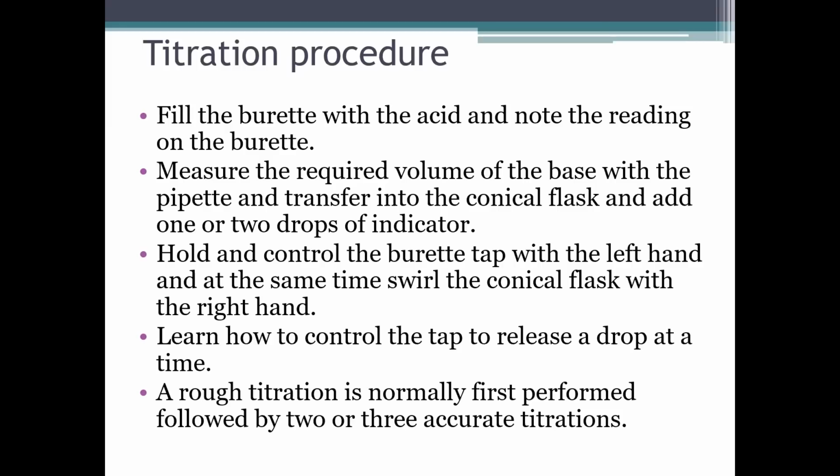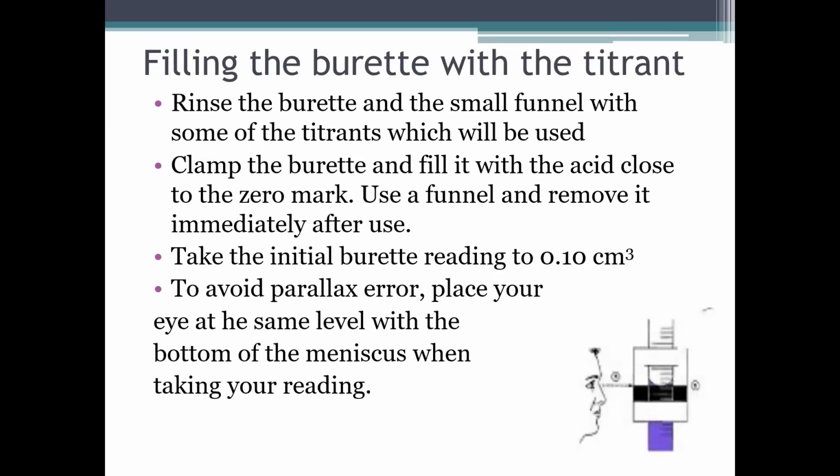And remember, the first drop that changes the color, you turn off the tap, that gives you your end point. Don't make the color darker. Don't make the color lighter. Once the color changes and you swirl and the color change persists; sometimes when the color changes and you shake your conical flask, it disappears. But the first permanent change in color gives you your end point.